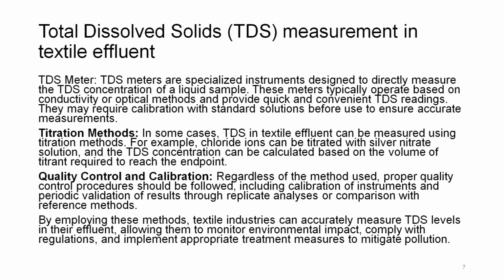So, what happens is that if the machine is calibrated, then we expect the correct answer. Suppose the machine has not been calibrated for a long time, then we are not sure whether it is working properly or not, because after all it is a machine and we cannot be 100% sure that all the time the machine will perform in a similar manner.